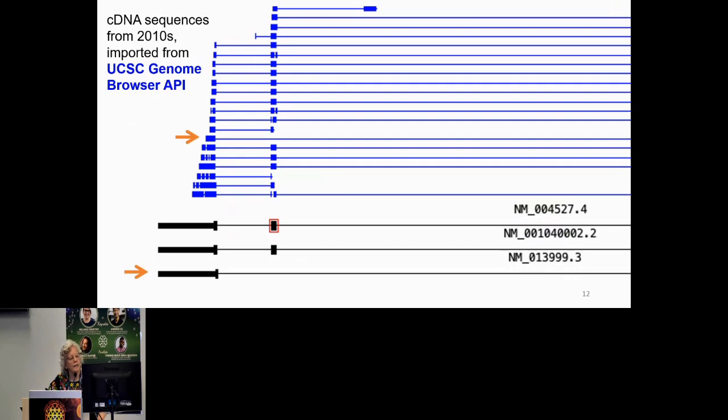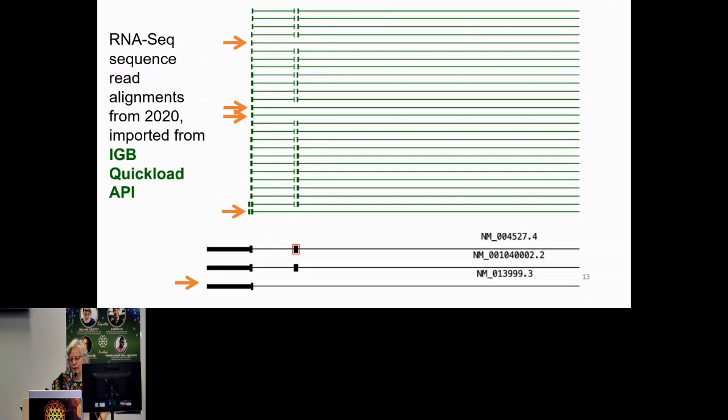What they're saying is that the exon skipped variant is much less commonly expressed than the exon included variant, which I guess makes sense. It's missing part of the DNA binding domain. It probably can't do a lot. But these are EST data. Like I said, they come from a lot of different data sources, a lot of different libraries. This one single variant that's missing an exon could easily be an artifact. So that's why we need to look at other data.